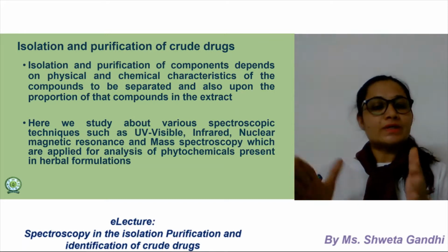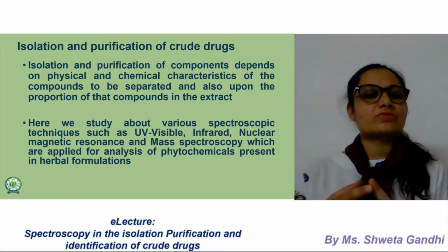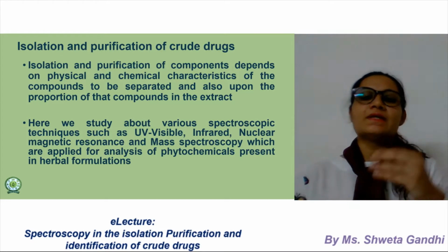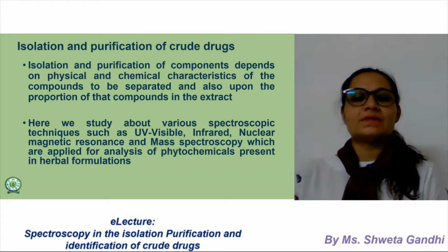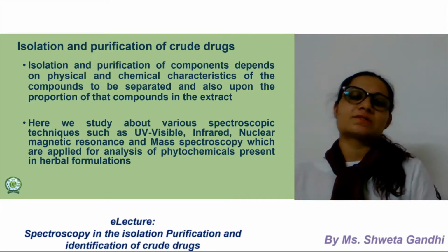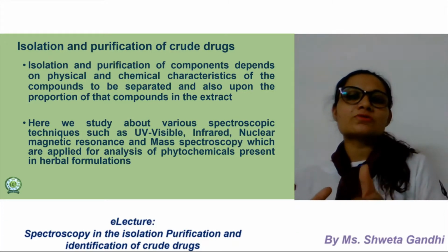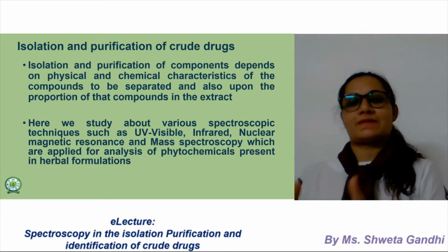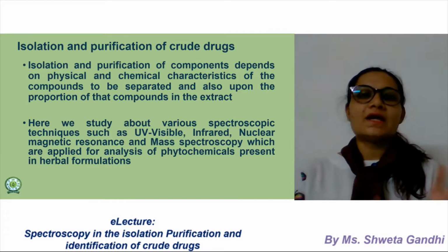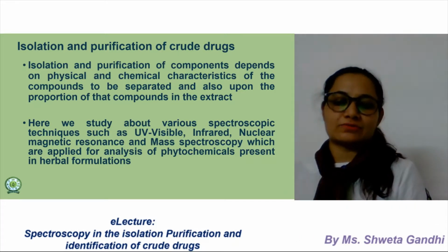Okay. Now here in this lecture we will study various spectroscopic techniques like UV visible, IR spectroscopy, FTIR spectroscopy, mass spectroscopy, nuclear magnetic resonance spectroscopy. This is called NMR. UV spectroscopy means ultraviolet spectroscopy. IR means infrared spectroscopy. NMR means nuclear magnetic resonance spectroscopy.